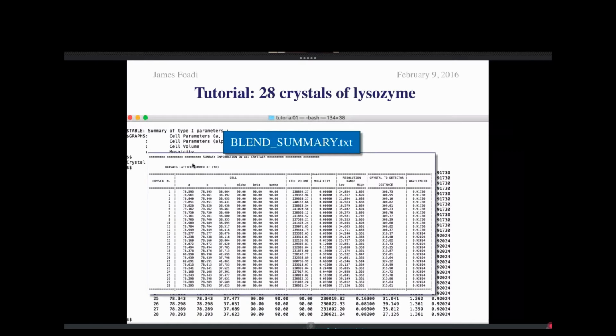This table is useful for various reasons. In this example, for instance, it is easy to spot datasets 19 and 21 as having values very different from the others. In this case, it should be due to wrong indexing.